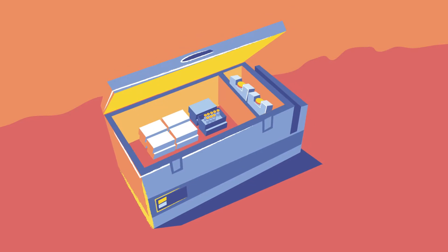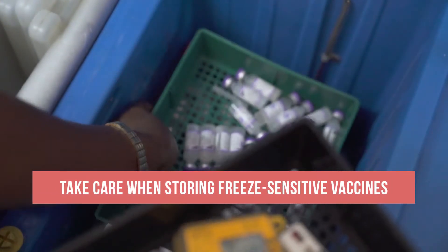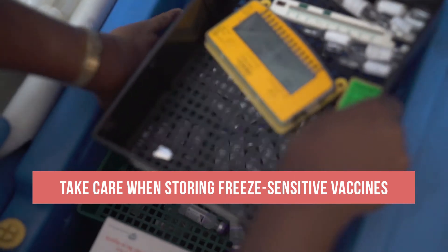Keep in mind that the coldest parts of the refrigerator are the bottom and the area next to the freezer. So special care should be taken when storing freeze-sensitive vaccines and diluants.